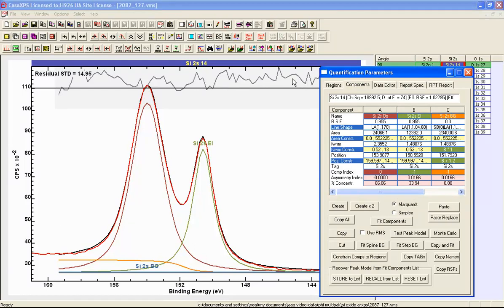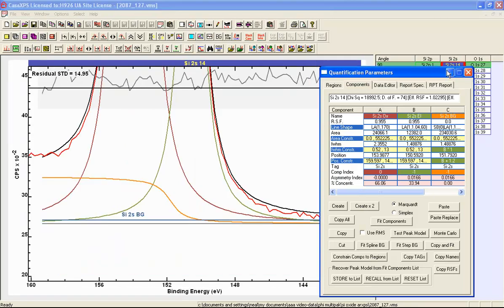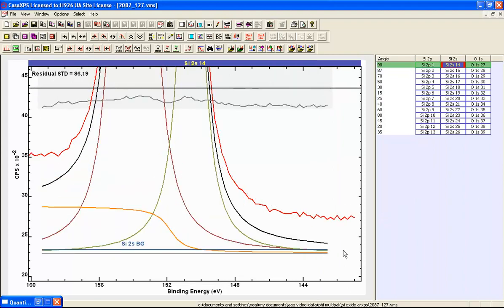So before I do this fitting, what I need to do is adjust the background itself, and this can be done by offsetting so that the flat background is no longer trying to fit to the data, and what will fit the components to the data will be this top hat function, which can be optimized at the same time as the Voigt functions and this Shirley shape.